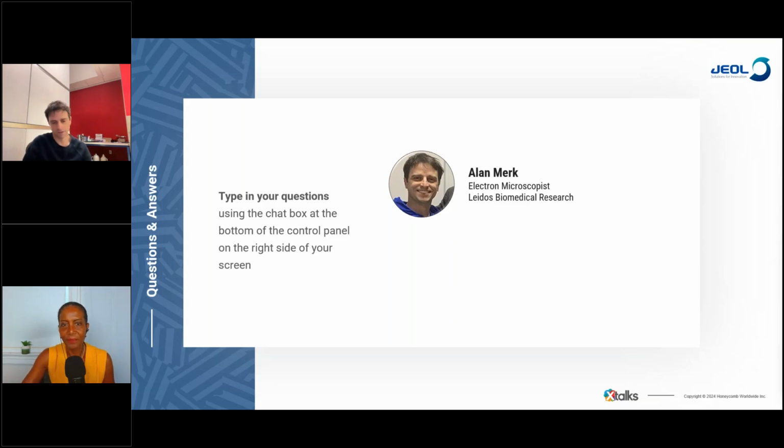Yeah, it's a great question. It's the number one issue. We have a group here in the building that has the Vitrajet, and obviously more and more people are using things like the Vitrajet and Chameleon and seeing how it goes. And there's been quite a bit of work on that. I know Mark Herzig's group is showing some really good results on small proteins from these types of grid making devices. So I think that's one of the last remaining challenges here. Now that the microscopes look really good, the detectors look really good, I think the specimen question is definitely the key challenge going forward.